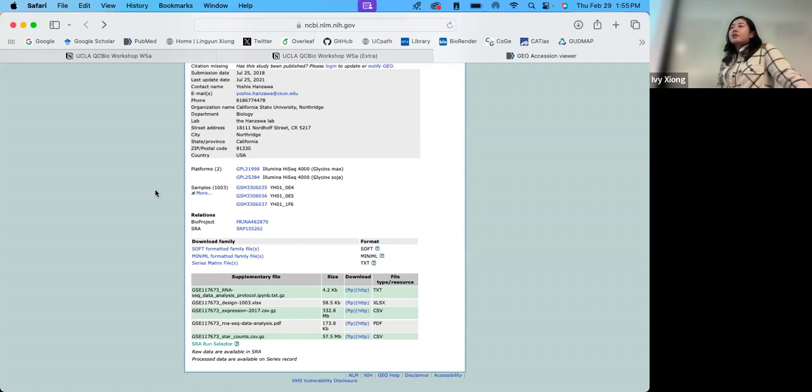So on the Hoffman toolkit you get cut off sometimes and you never know. And if you're using a lot of CPUs, they put you on hold and resume at some later time. Those are issues on Hoffman2 to bear in mind. So it's not that I couldn't automate the download process; rather, I have to double check that the download was successful, and that takes the most time. If it's unsuccessful, you have to restart and make sure you know which one is which. But you have to manually go through 1,000 of them to see. I only dealt with 200, and that's about what I wanted to do.